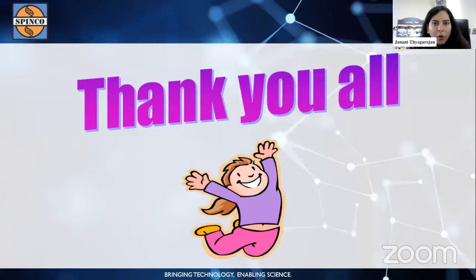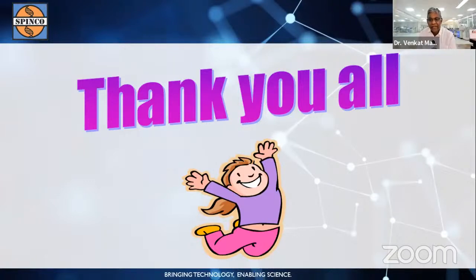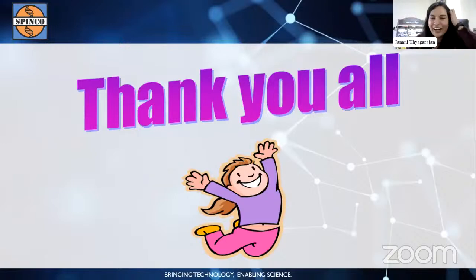Which is best for work, HPLC or MS or LC-MS? Which work? It depends on the work that you're doing. How much peak intensity will be considered, and how can we do relative quantification? Those come under applications. When will we conduct the next lecture? It will be next month. We will provide you the information.